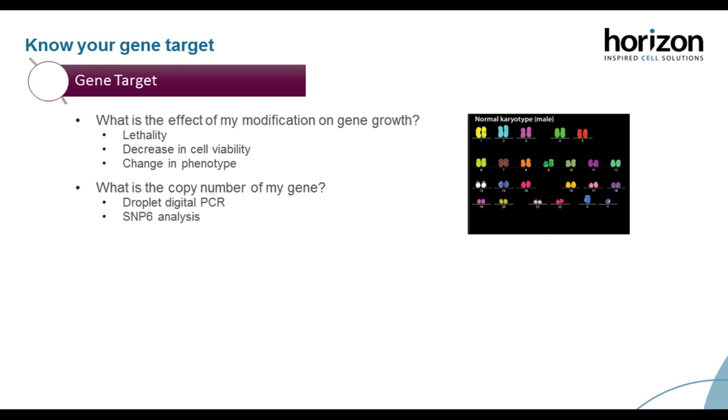However, this is a very rare genotype for your isolated cells in culture. If you pay attention to chromosome 1 in this next insert, in this HeLa cell line, you actually don't have 2 alleles for chromosome 1, but you actually have 3. And you have a whole host of other genes that aren't reminiscent of any other chromosome down the bottom of the screen.